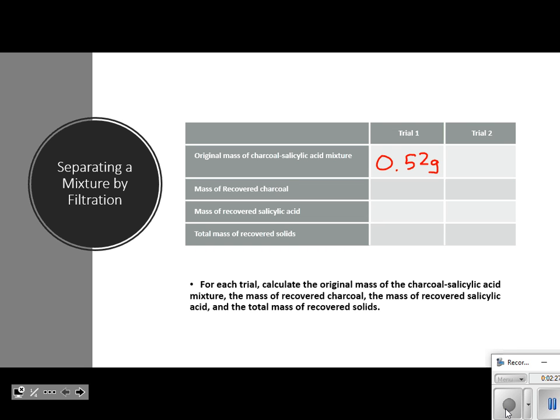How far does the digital scale carry the number out? How many places? Yeah, Carly? To the 100th place. So whenever I'm making a mass on that digital scale, on the ones that are at your lab table, we need to have those values to the 100th. If you only have it to the 10th, you can do more. We can be more precise than just that 10th.